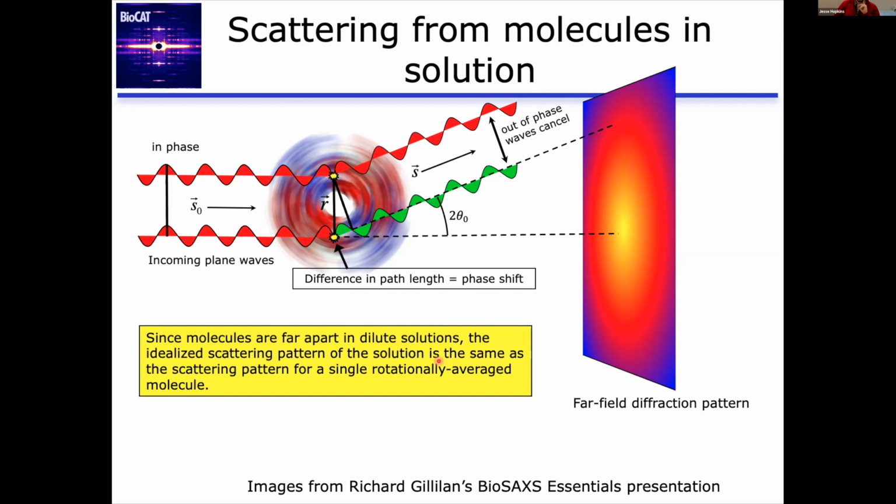So conventionally these days, and actually for the last 20, 30 years, all scattering patterns have been measured on these two-dimensional detectors. But it turns out there's only one dimension of information in here. If you start at where the beam would intersect the detector, at the beam stop, and you go out some distance on the detector, everything at a constant distance from the beam stop, that circle around, should have the same value. And that comes out as a consequence of the mathematics of this rotational averaging. So instead of there being two dimensions of information on our big, nice detector face, there's only one dimension, which is how the intensity varies as a function of distance from where the beam intersects the detector.